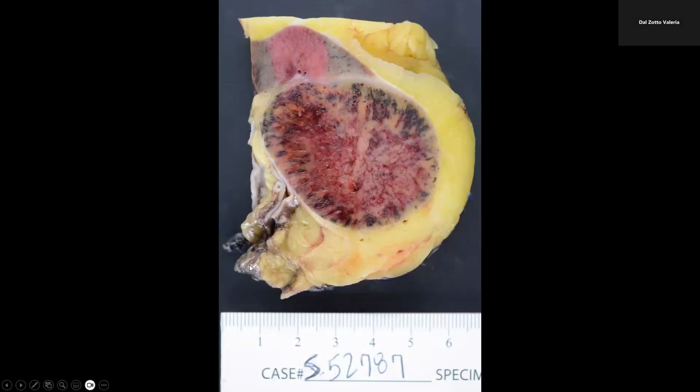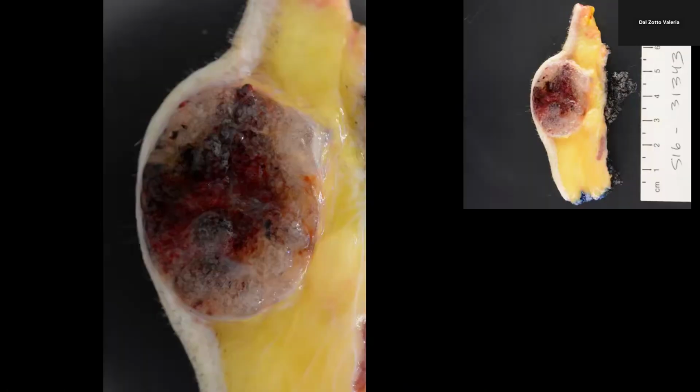You can guess also what kind of organ it is. Here is the tumor, the shape, the borders, the color, and the consistency. Those are the descriptions that you need to practice. That is why, if you want to email me, I will be happy to receive your answers.